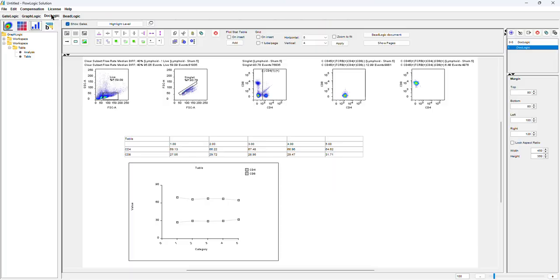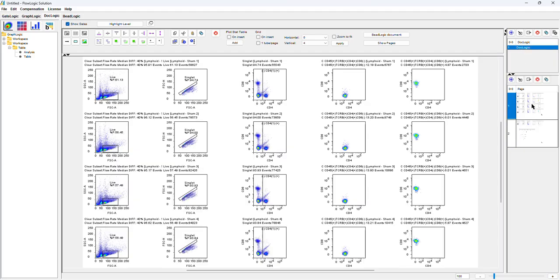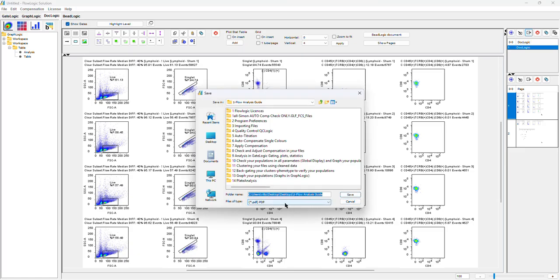Now, when you are in the report, obviously we want to print out the report. So here are the various options. PDF. A quite interesting option is PPTX. And where to save the report is obviously your choice.